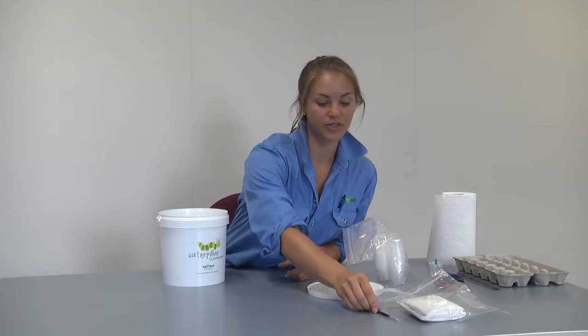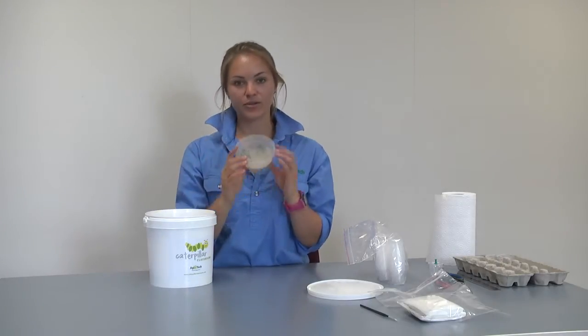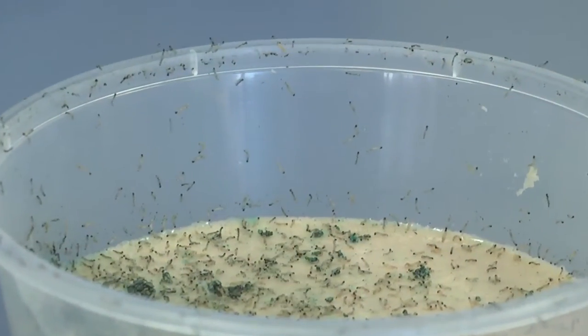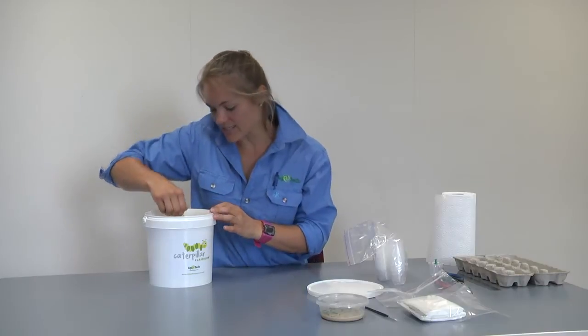You will be provided with a paintbrush, but you may need to find some more depending on the number of students you have. You'll also find a container which will either have eggs or neonates in it. Neonates are small hatchlings.